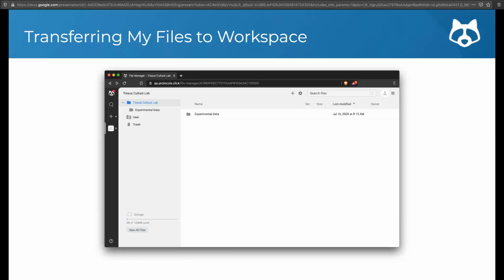Great. And then there's another question. Can I invite users to the workspace only to view and run the protocol, but not able to edit? Yeah, so that's a great question. Depending on how involved you want that person to be, you might be more interested in just sharing a link to the protocol that you have. Although if you are planning on managing the run records of that particular user and inviting them to the group, then you might want to actually invite them to your workspace. So I guess it depends on how involved you would want that user to be.